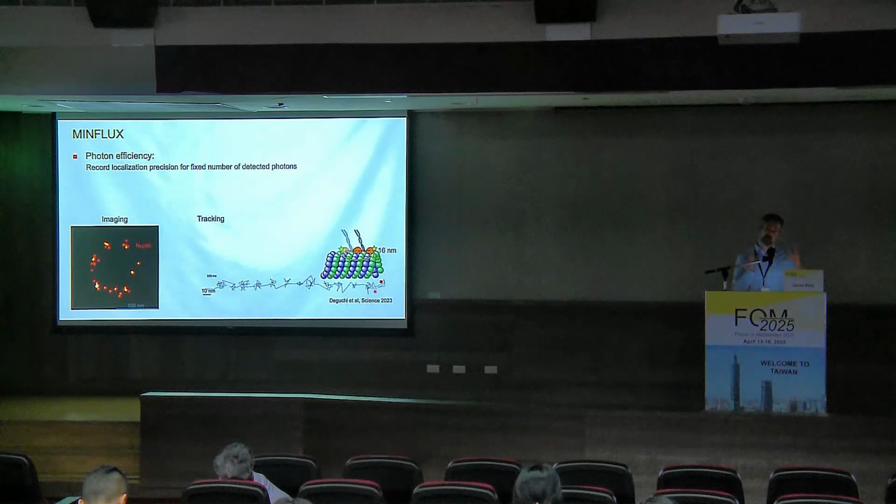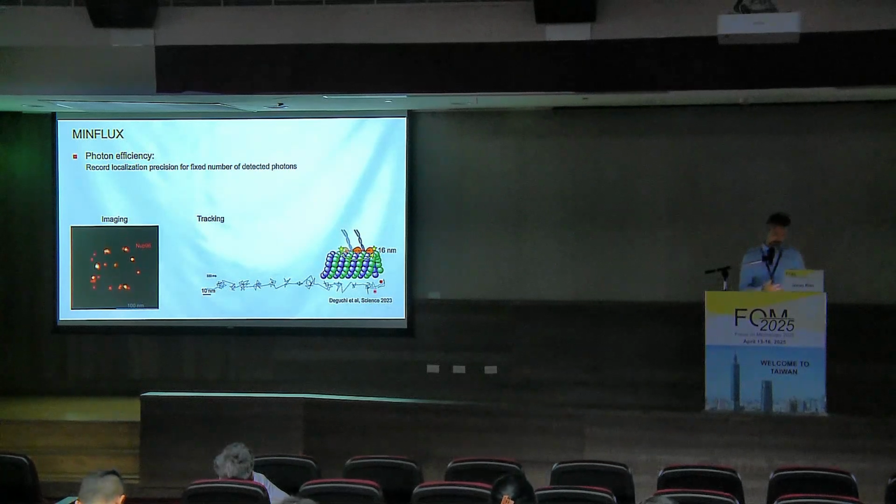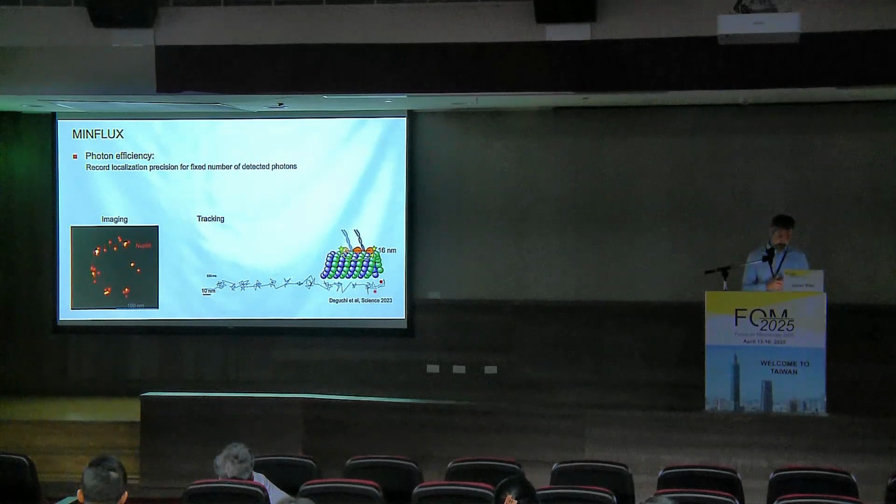And there are now 2 main applications for MINFLUX. One is imaging, and you see here a single nuclear pore complex that we could image with a commercial MINFLUX instrument, and you can appreciate the high 3D resolution that we obtained here. And the other is single particle tracking. And I will briefly explain both of these approaches.